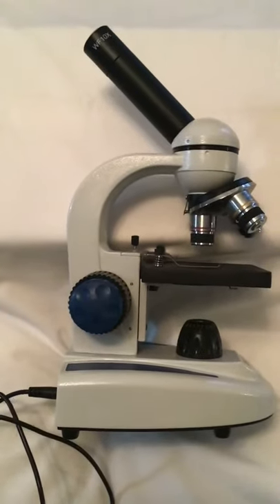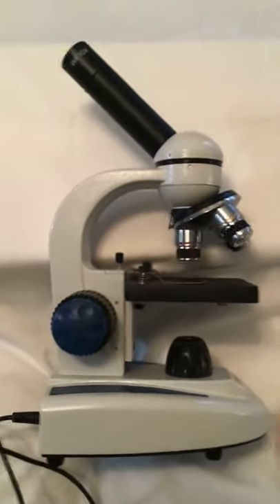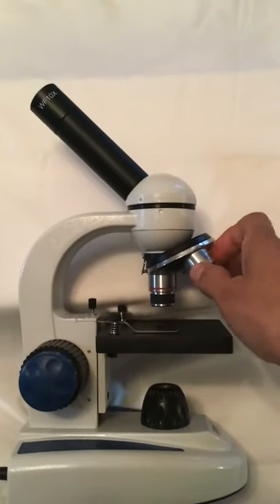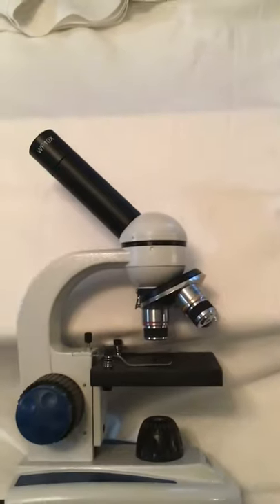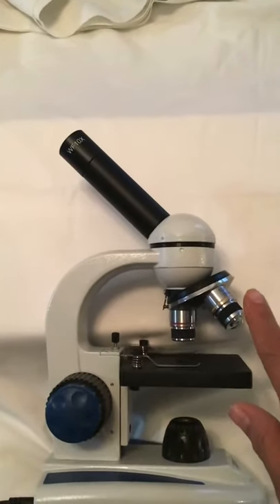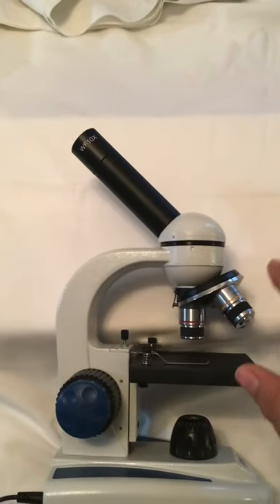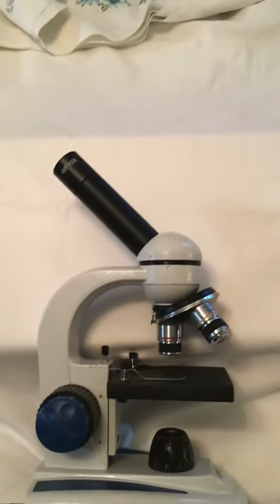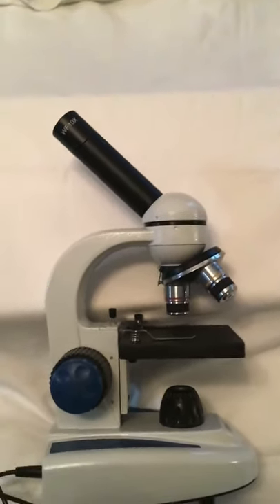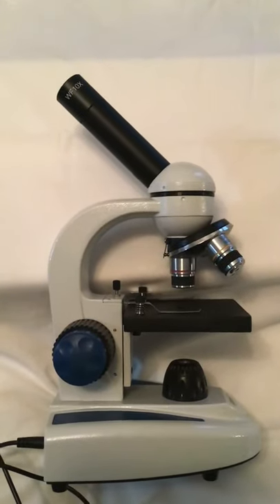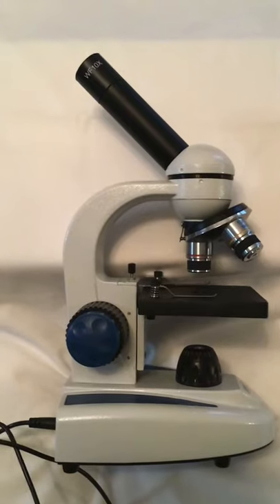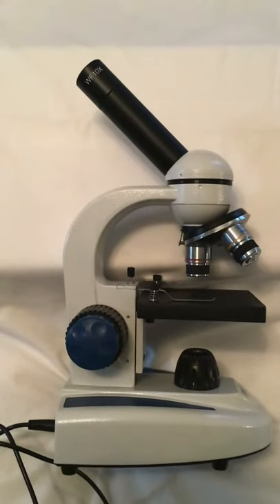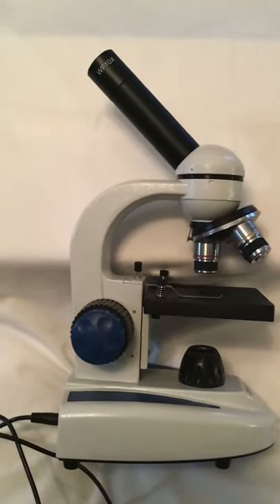This compound microscope gets its name because it has multiple lenses in order to see things that are difficult to see with the naked eye. It has a scanning lens, a low objective, and a high objective lens. The low objective lens increases the magnification, and the high objective increases it to where you can see even the smallest structures or the basic structures of a cell.